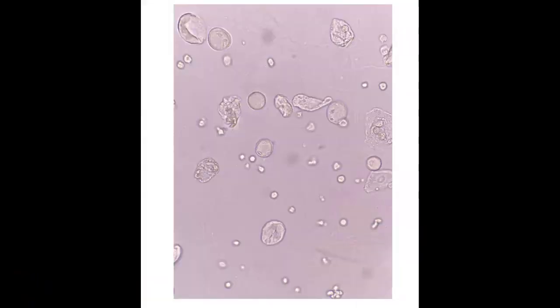All right, so here is the mystery. Take a look. See what you think. I'm going to let you look at it for a minute. You can see these little structures here. I'll tell you what those are. Those are your white cells. And then we have a couple that look like little red blood cells. See these little guys back here? All this here? That's mucus. We have some epithelial cells. This stuff's kind of out of focus, so we can't quite tell, but you can see mucus.